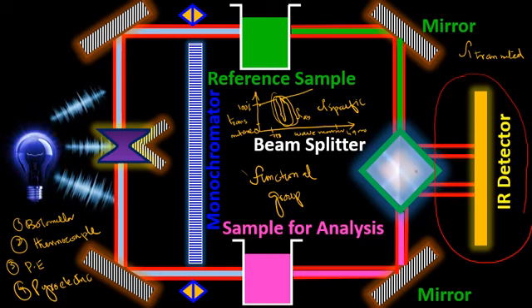The radiation that reaches the detector is then passed to a readout system, which interprets the transmitted radiation from the sample into the infrared radiation spectrum.